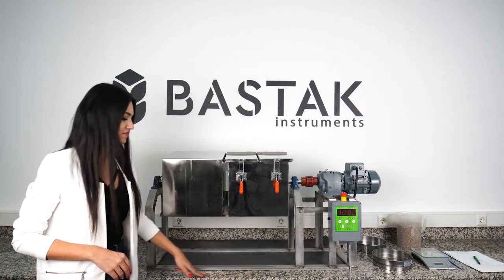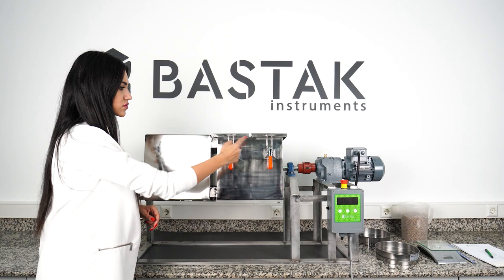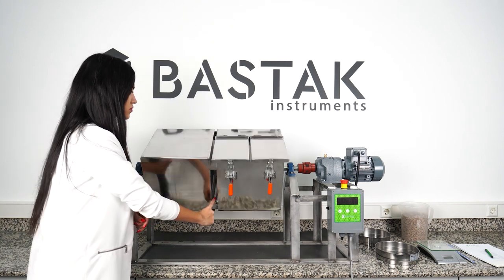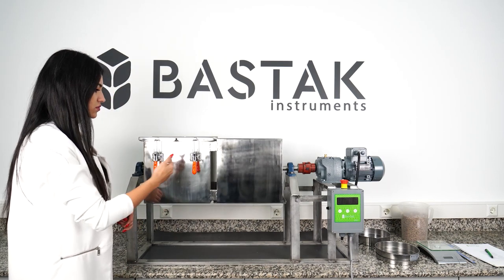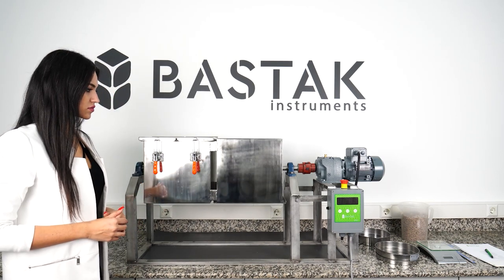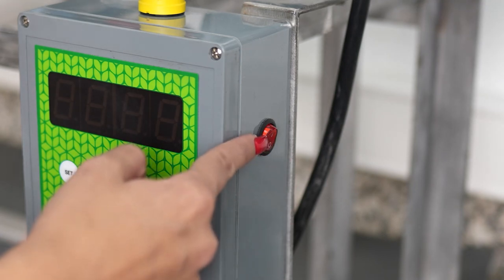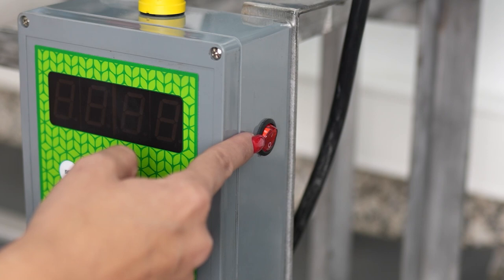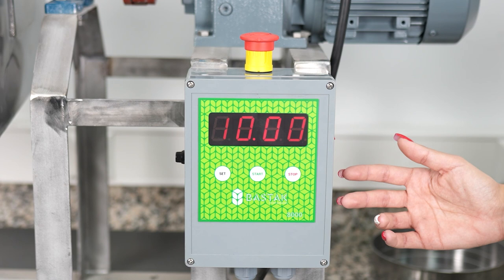The device is placed on a flat and sturdy surface. The holding connection elements are components that enable the opening, closing, and locking of the sample chambers of the device. The on and off buttons on the control panel enable the device and control panel to turn on and off, respectively. The control panel is the unit that oversees the operation of the device and allows for adjustment of process settings.